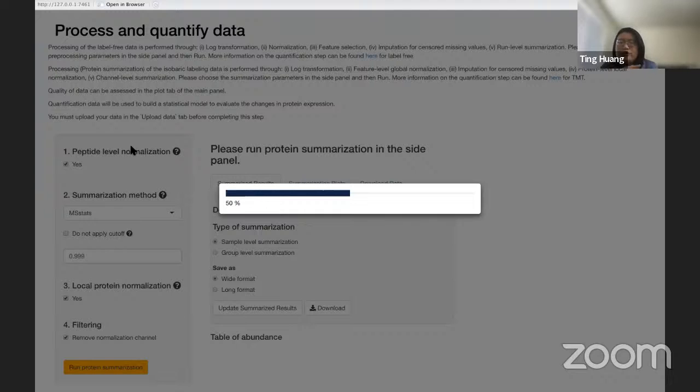That's why you need to be careful whether you want to apply it. For example, in some thermal experiments, like TPP experiments, you apply a different temperature to different samples. That influences the abundance of most proteins, which means you can't expect all the samples to have similar protein abundance, because the treatment changes the abundance of most proteins.